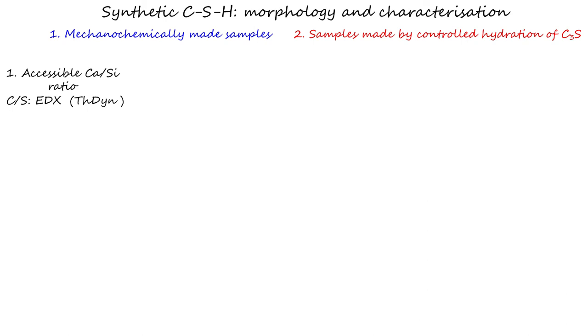Its determination is not necessarily trivial, and we refer to Elena's thesis for details. The values given here were determined in a TEM with the EDX technique, and it was made sure that no traces of crystalline hydration products were present at these spots. In brackets, for the controlled hydration samples, a value from a thermodynamic model is given as well.